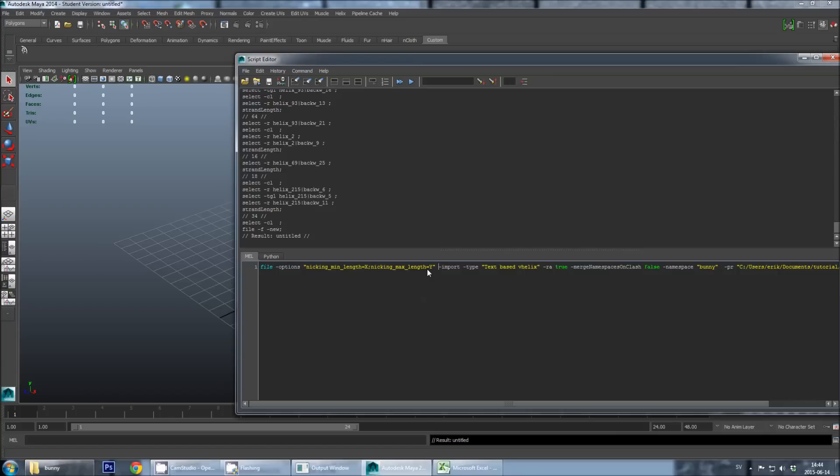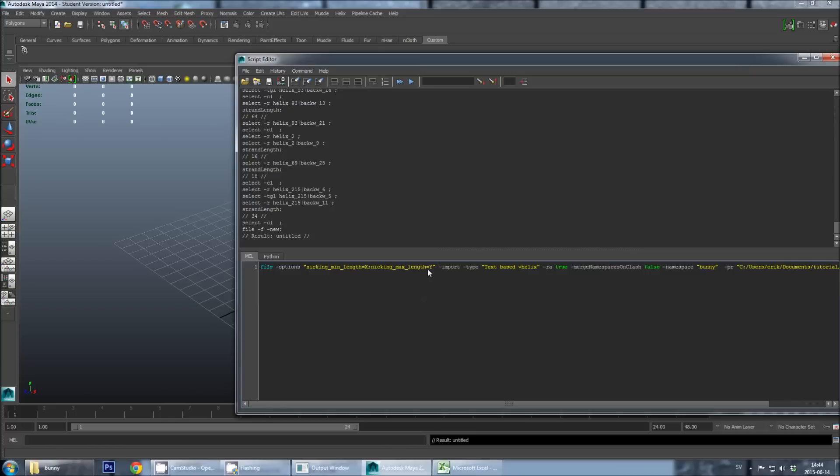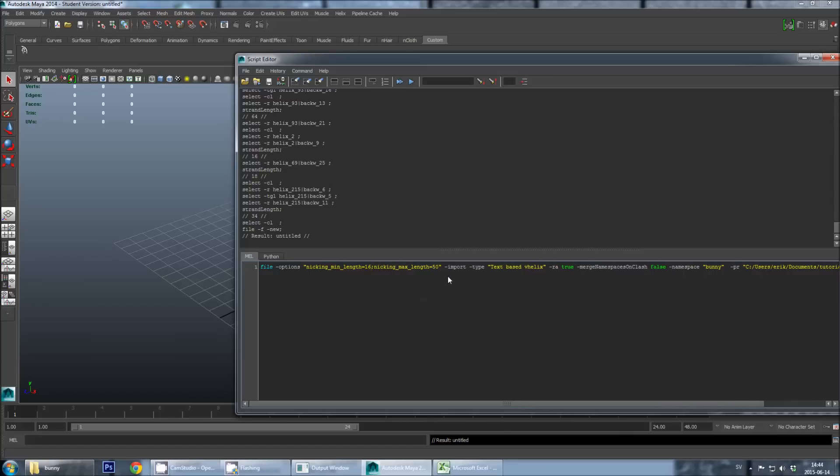And then the second value here, nicking max length, which I have put to y, is the maximum staple length that V-Helix should generate. And this is normally regulated by how long staples you can order from your supplier, DNA supplier, at a reasonable cost. And as you might understand, these two values are actually competing with each other. And it might not always be possible to satisfy both values. So usually you have to try some compromise values and see what the output is. But I will do it in this case with the x value of 16. So V-Helix will avoid putting nicks on edges that are shorter than 16 bases. And I will put the y value of 50, meaning that V-Helix should not create staples strands that are longer than 50 bases. And then I will hit Ctrl-Enter.